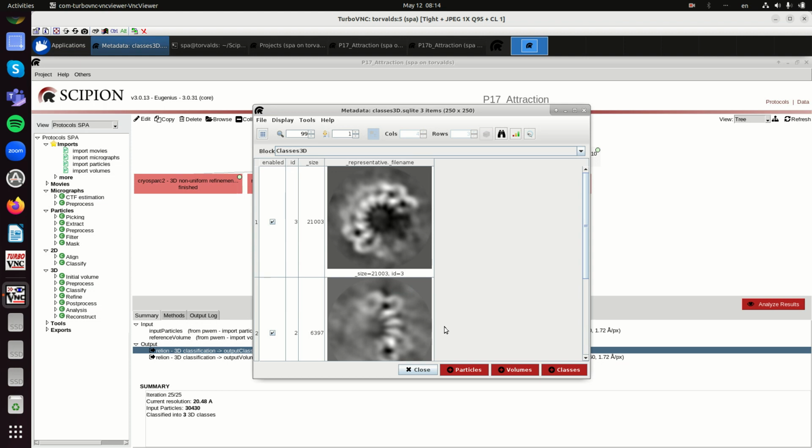So those are three different subsets of signals, but it is not the classification that we would like to have from the biological point of view. So pure signal processing cannot solve the biological problem. We have to put in a priori information somehow, or try to guide the optimization in such a way that it converges to the right point.